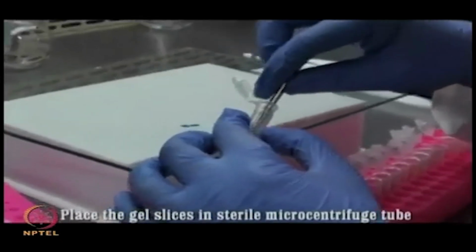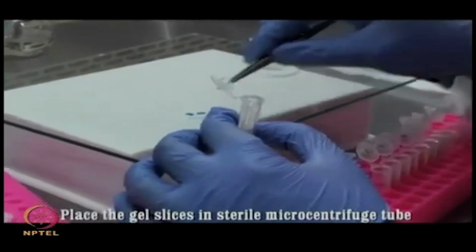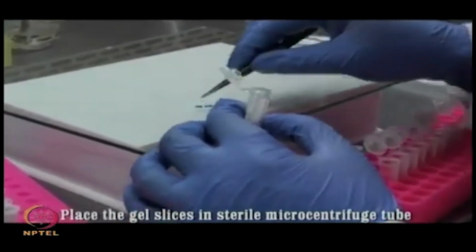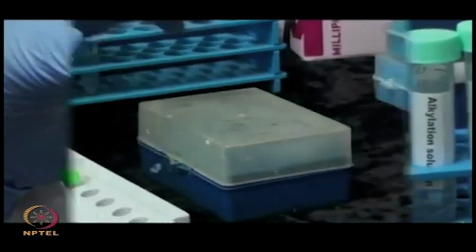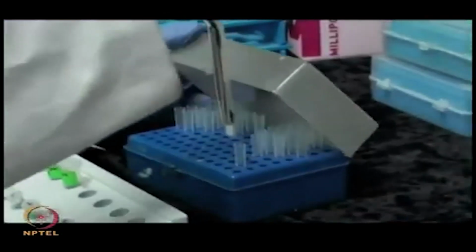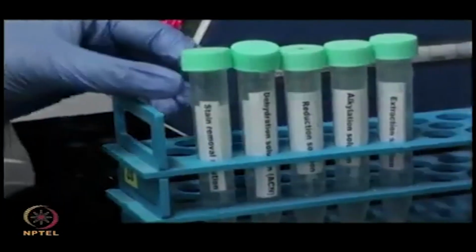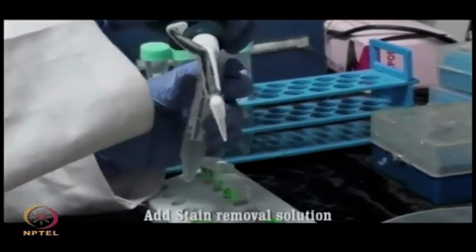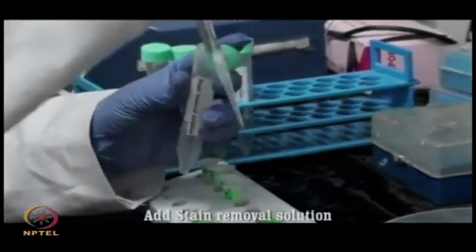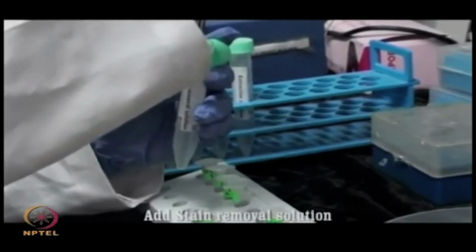Now, keep these small gel pieces in a sterile microcentrifuge tube. Now, you can add 50 to 100 microliters of stain removal solution. For the large gel pieces, take enough liquid to cover them completely. So, you can adjust the volume depending on the size of your spots or the band.